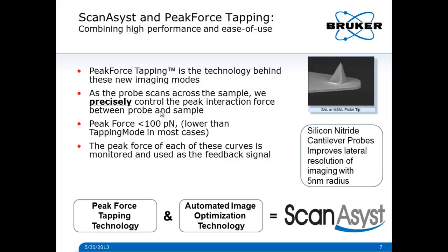PeakForce Tapping is the technology that we've been talking about behind these new modes. As we scan across the sample, we're controlling the force at the peak of that force curve, the peak interaction force between the probe and the sample. And we can control this peak value to less than 100 piconewtons. This is often lower than tapping mode on the same samples. The peak force of each of these curves is monitored, and then that's used as a feedback signal.